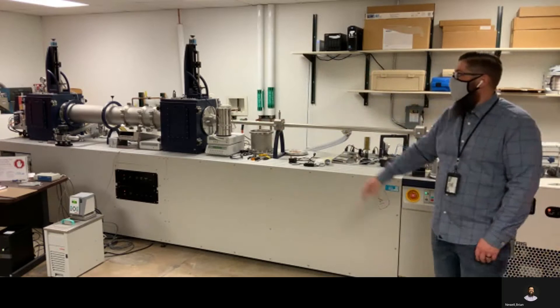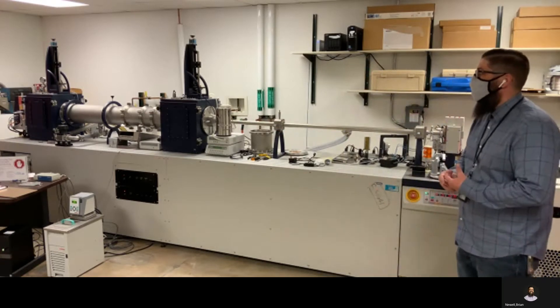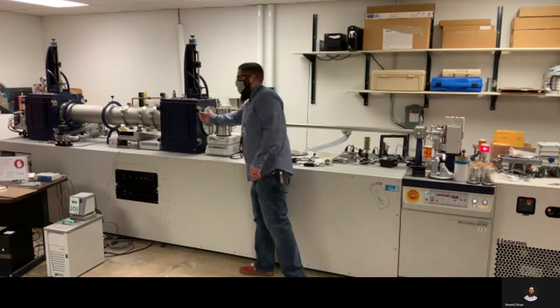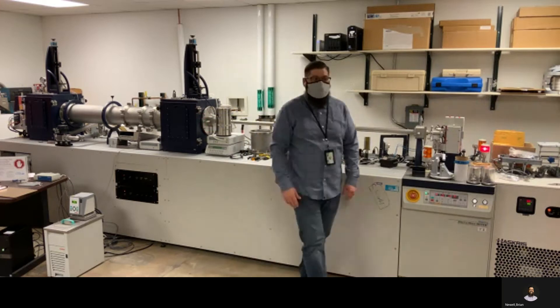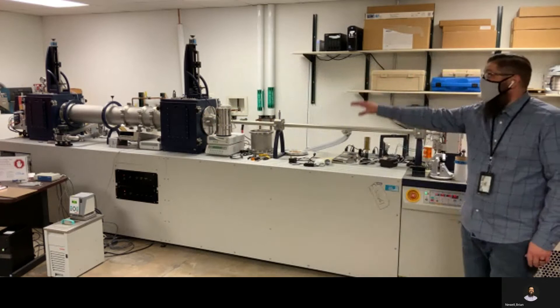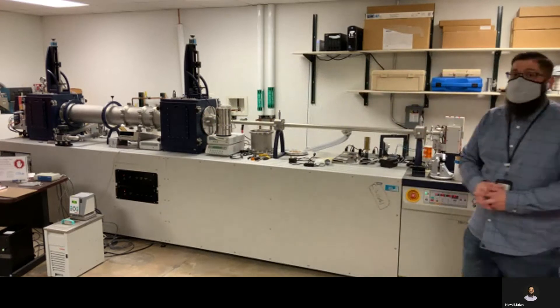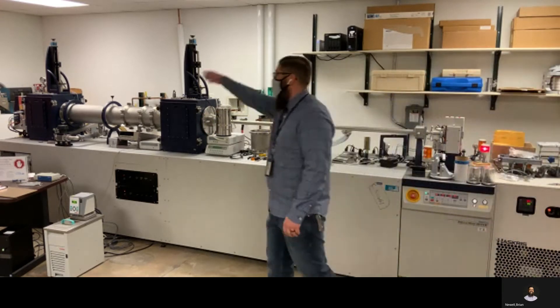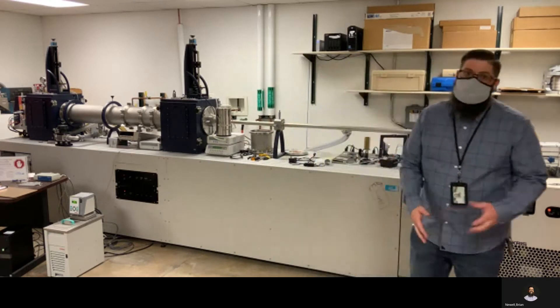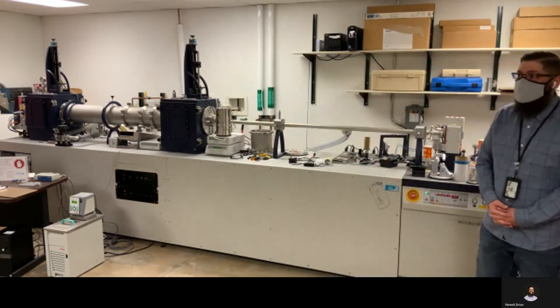The two blue sample chambers that you see are where the work is going to be done. The sample chamber closest to the source is going to be for the small angle x-ray scattering. Then we have a sample chamber closer to the detector, which is way on the other end of the instrument, and that will be for more wide angle or medium angle scattering experiments.